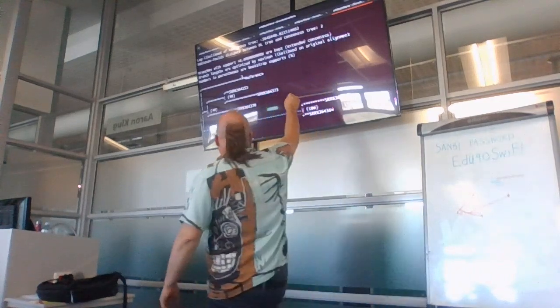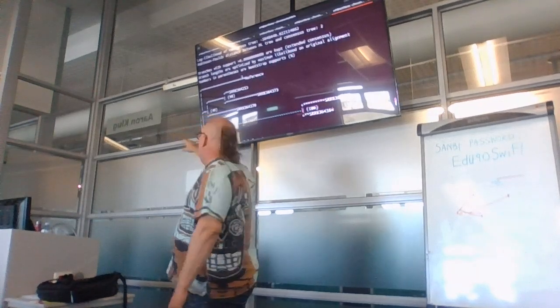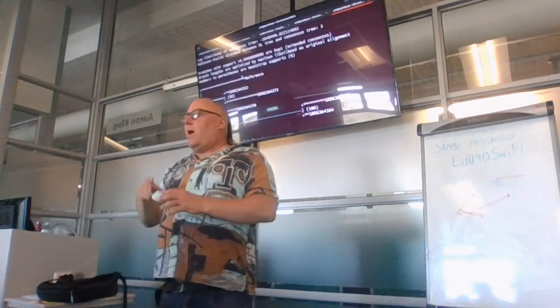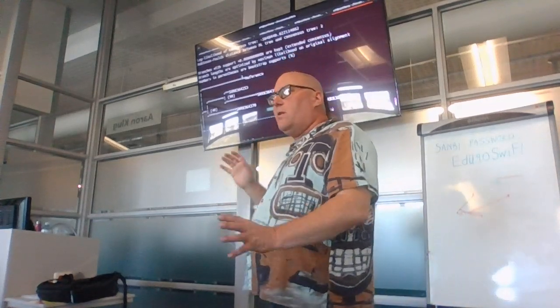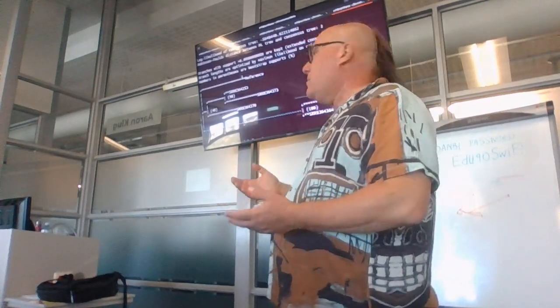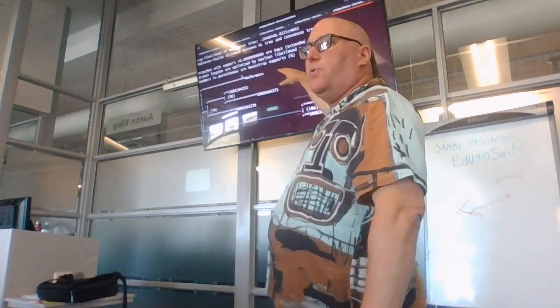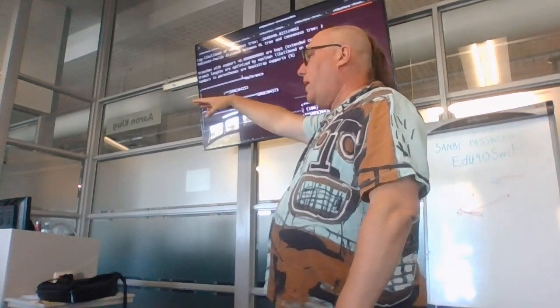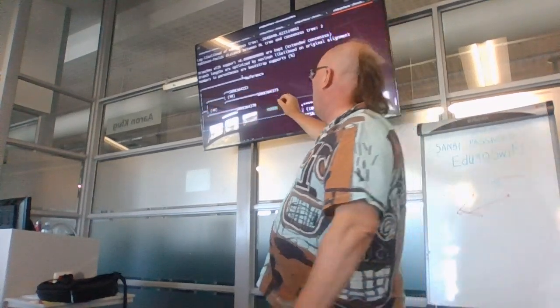So maybe what should be the case is that the reference is all the way to the left because it's earlier, and that this branch is longer, because actually we know the evolution. Because it doesn't have the sense of time, it's putting another alternative hypothesis in front of us, which is that the reference accumulated a whole lot of SNPs relative to the inferred ancestor. But we don't have the inferred ancestor, so that's why it's drawing it like this.